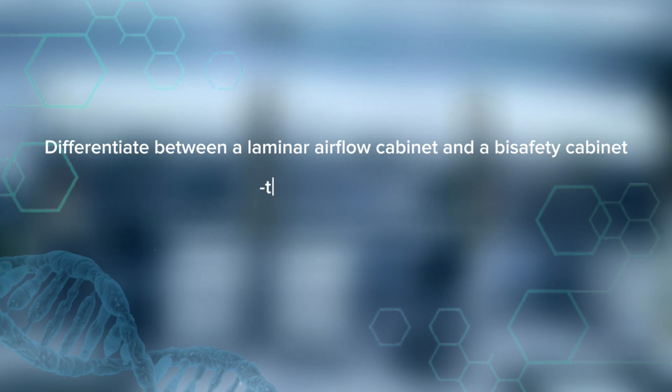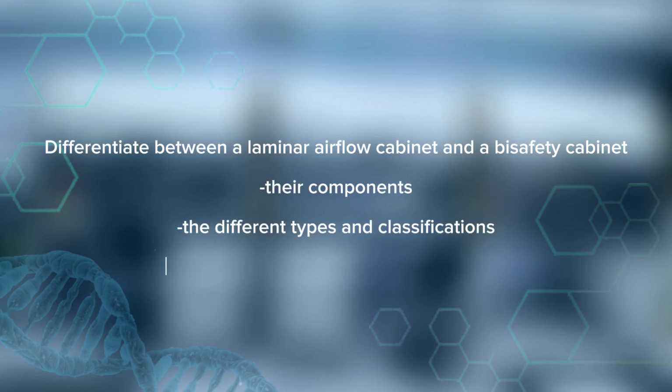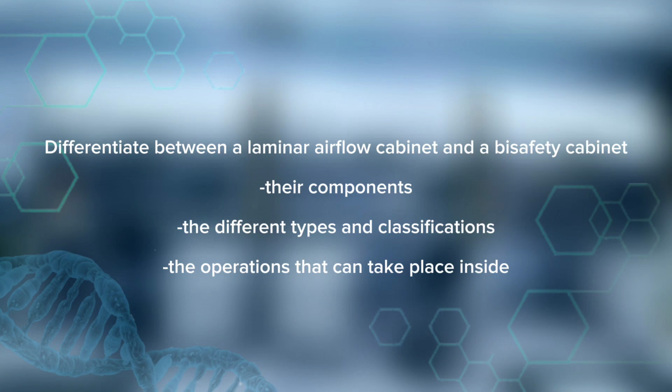In this video, we just learned how to differentiate between laminar airflow cabinets and biosafety cabinets, their components, what agents can be handled inside of the different BSC classes and types, and what operations can take place inside of them.